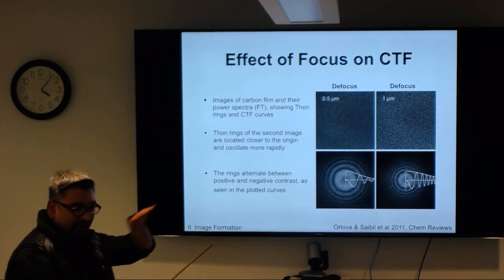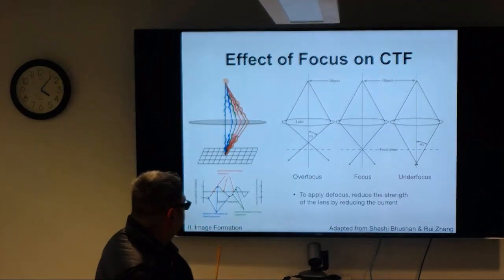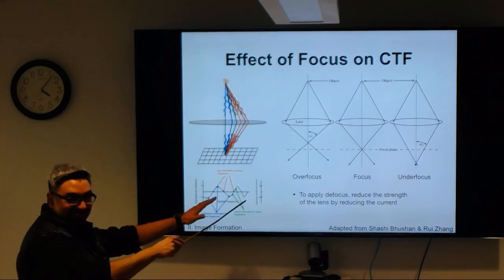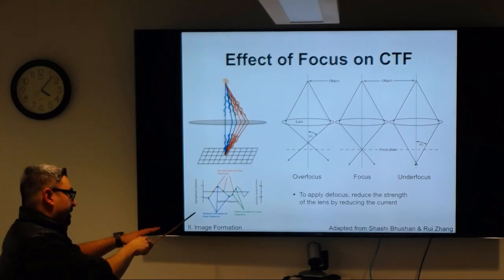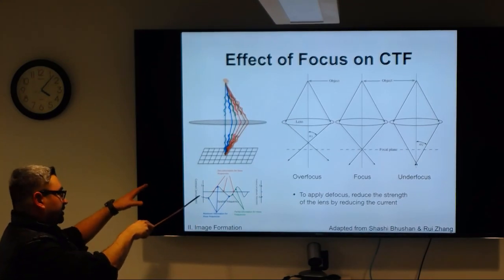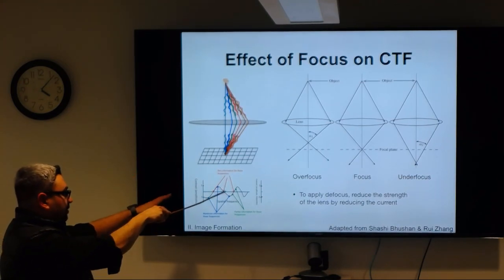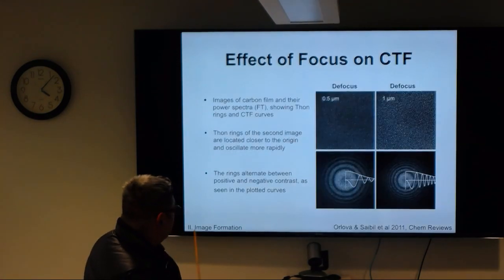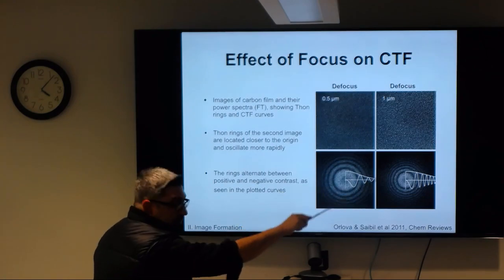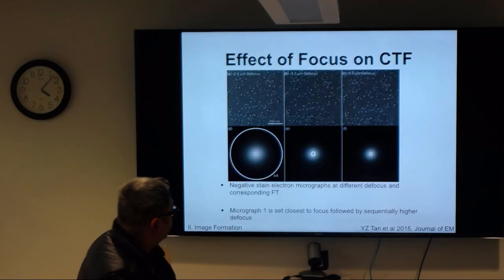So when you look at the contrast transfer function, I want you to try to always think about this. Okay, so here are the maximum values for these frequencies, here's the zero information, and then here's, you know, this partial information. So you can think of that here as well. Okay, so this is just showing the two different defocuses.